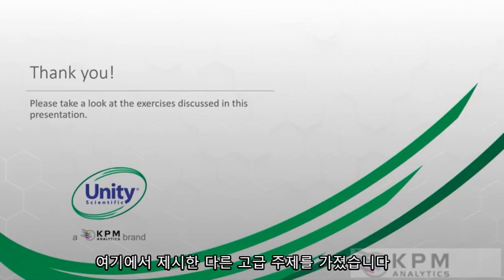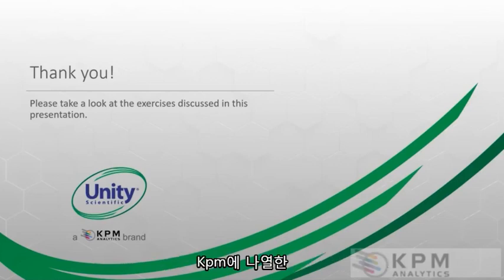And then we have the other advanced topics that we presented here. So those are represented in the various exercises that we have listed in the KPM Academy. And again, if you find yourself in these situations where you're using these advanced tools and you have questions, please contact the KPM Unity product specialist.